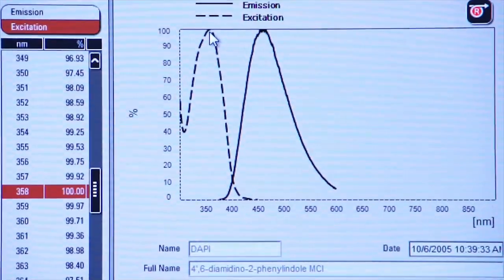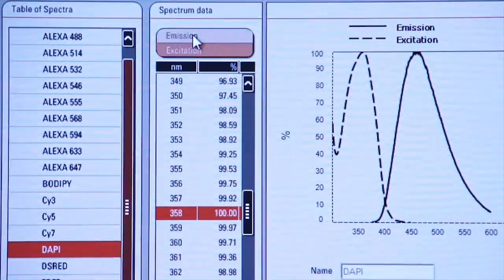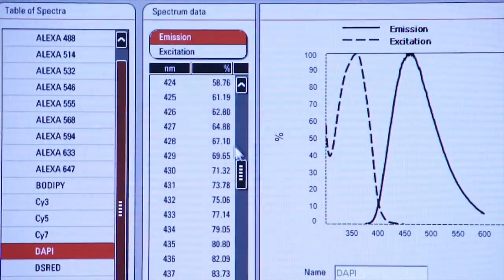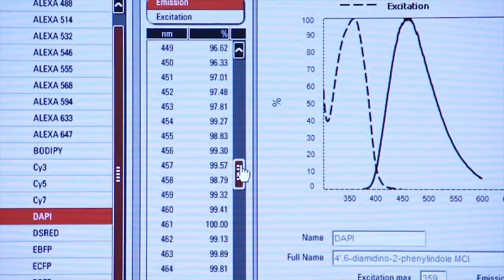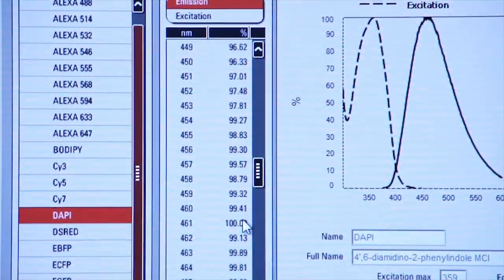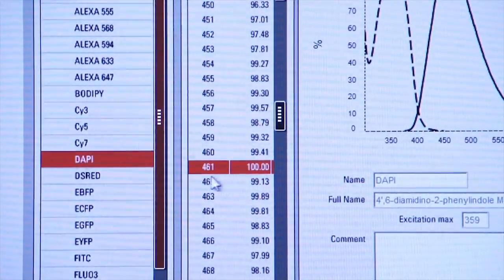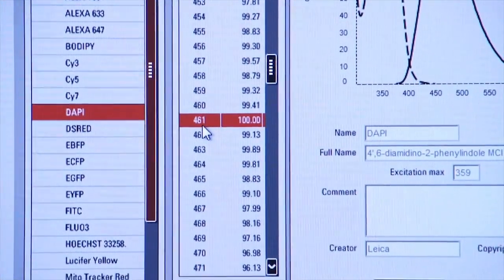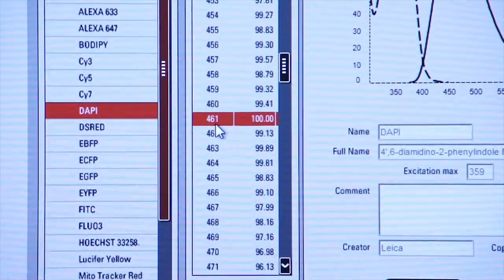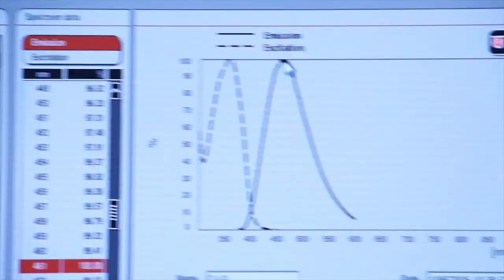What about the emission? If we click on emission, again we can scroll down until we see 100%. We click on that, and now you see that at 461 nanometers, we have full emission from our fluorophore.